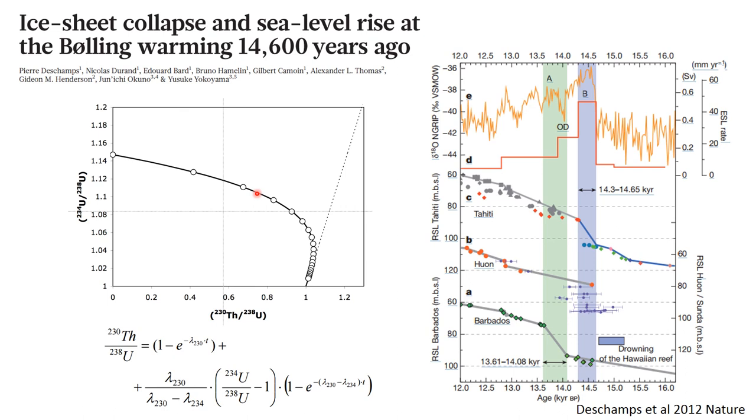Plasma ionization is quite good for this, because if you look at the ratio we're trying to measure, one of them is a ratio of two different elements, one of which, thorium, is quite hard to ionize, while uranium is a little bit easier. So it's quite good to measure this on a plasma ionization mass spectrometer, because measuring both of these different elements is easily possible.